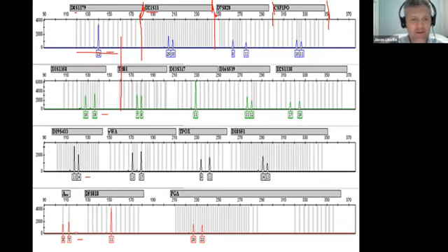What we haven't shown is that right before we ran this sample, we ran a ladder. And we didn't have to run 16 different ladders. We run one ladder that has all of the alleles, all of the loci. What a ladder looks like, and I should probably throw it in here, is it will have a blue peak, a blue peak, a blue peak, a blue peak, and it has like 10 blue peaks that are between 120 and 170. And the peaks, remember, we have the tables there.